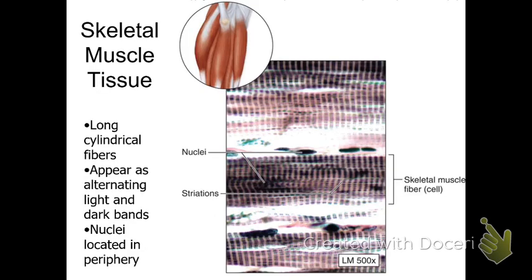So let's start off here with skeletal muscle tissue. This is a good representation of this. Now, when I see skeletal muscle tissue, again, this is what is making up the named muscles of your body. So as we get into a lab or two from now, and we're learning about the biceps femoris or the rectus abdominis or the frontalis muscles, any of the muscles that you'll be learning in the body, this is what they look like under the microscope. You see a very strong striping pattern.